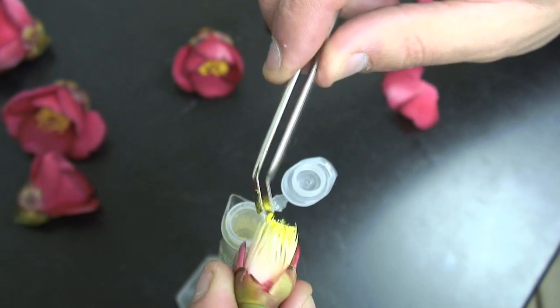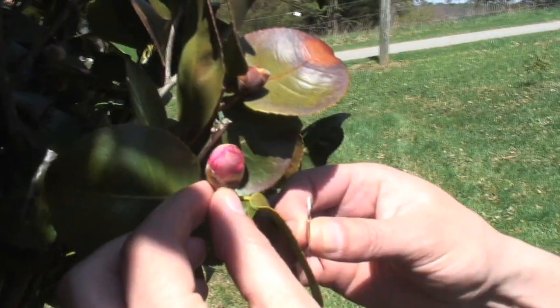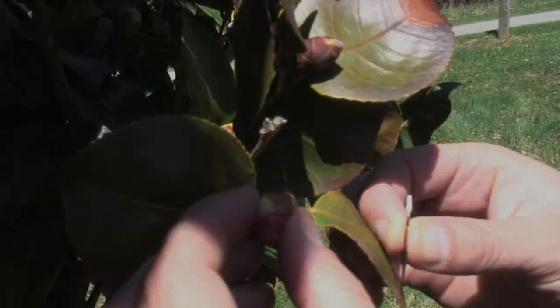After collecting pollen from our paternal parent, we select a flower that is showing color but has yet to open. Flowers at this stage are ready for emasculation.